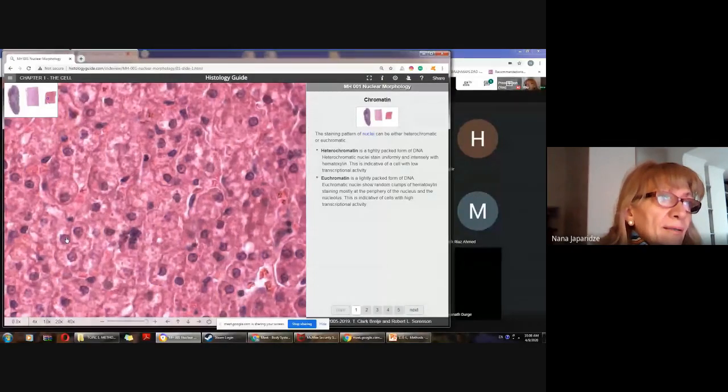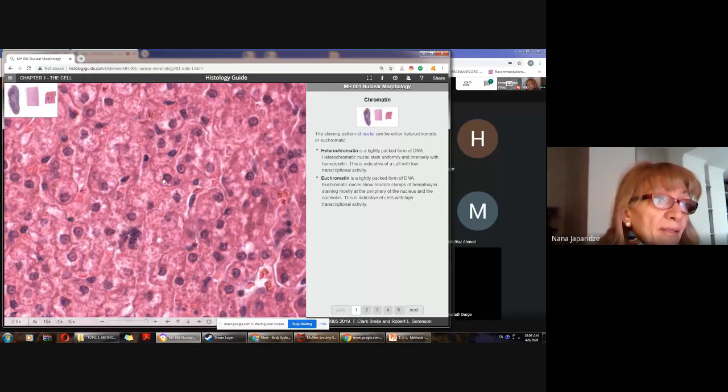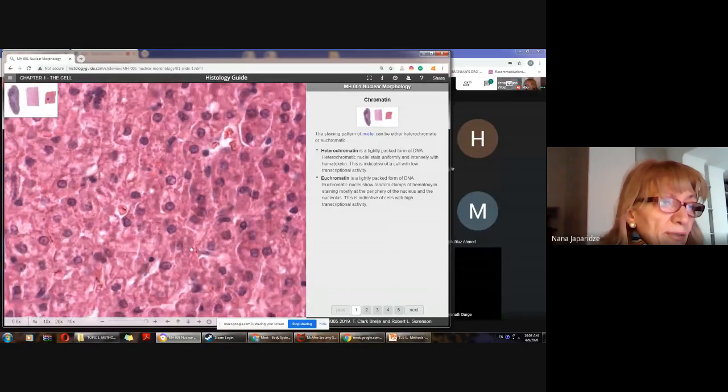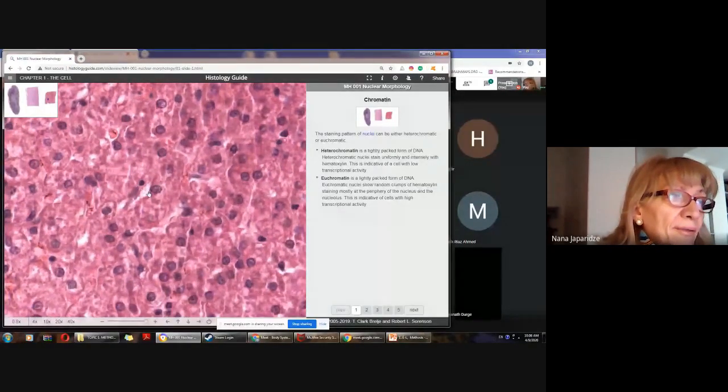These are epithelial cells, and these are nucleus with nucleoluses. Plus you can see in this nucleus quite densely dark stained part, which is in the nucleolus itself and on the periphery of the nucleus.